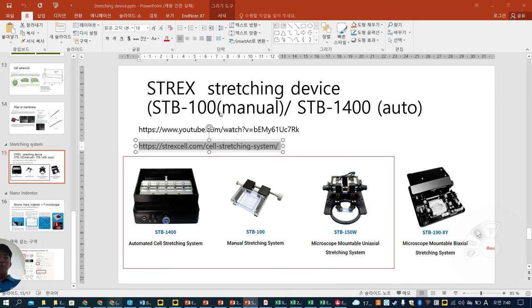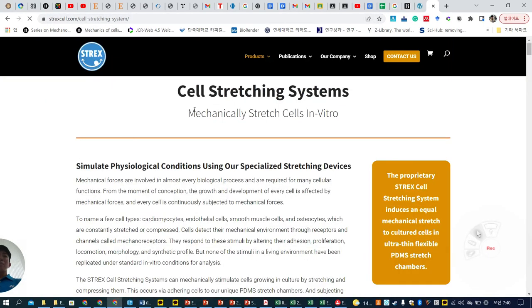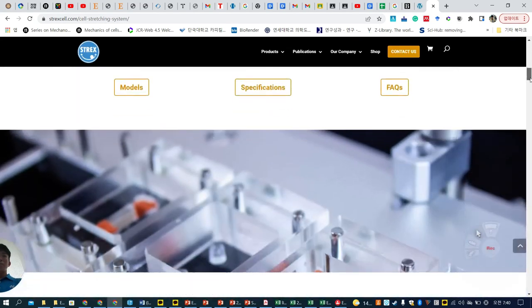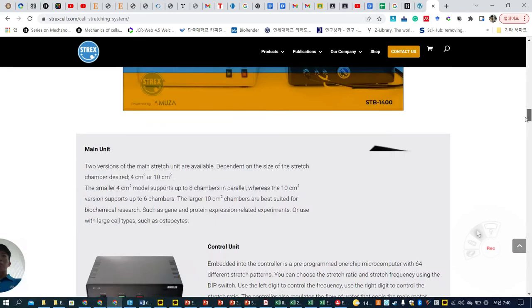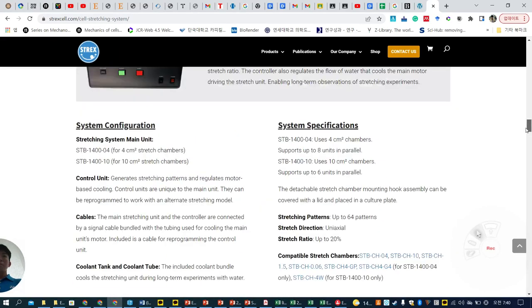Let's visit this website. Strex Cell is originally a Japan company, but in the worldwide headquarters, they also have it. So yeah, you can get a lot of information about this stretch system here.